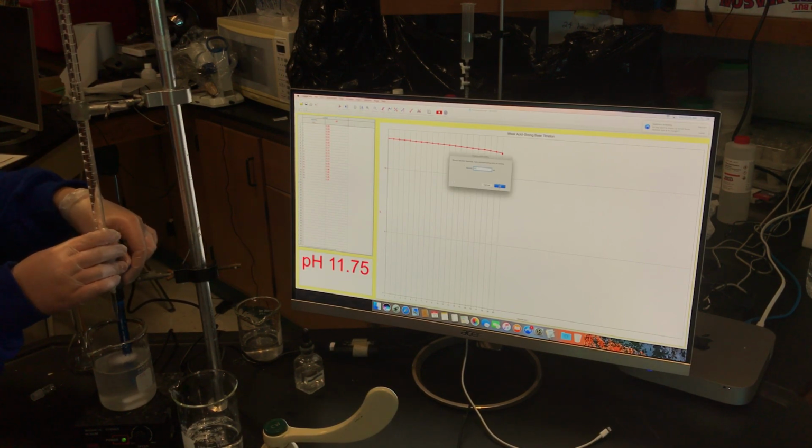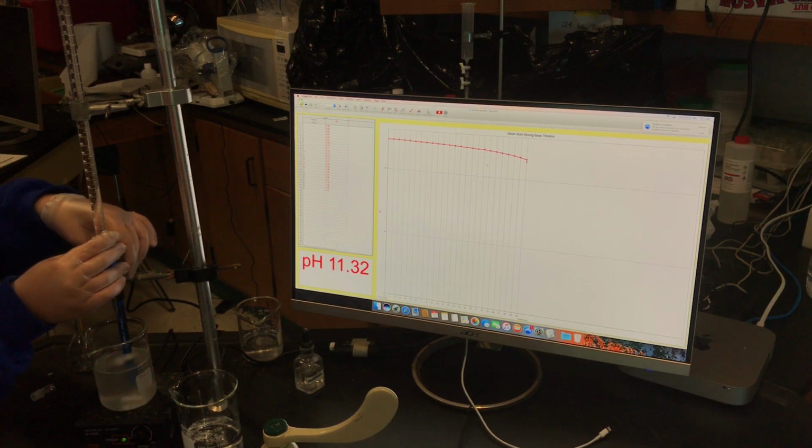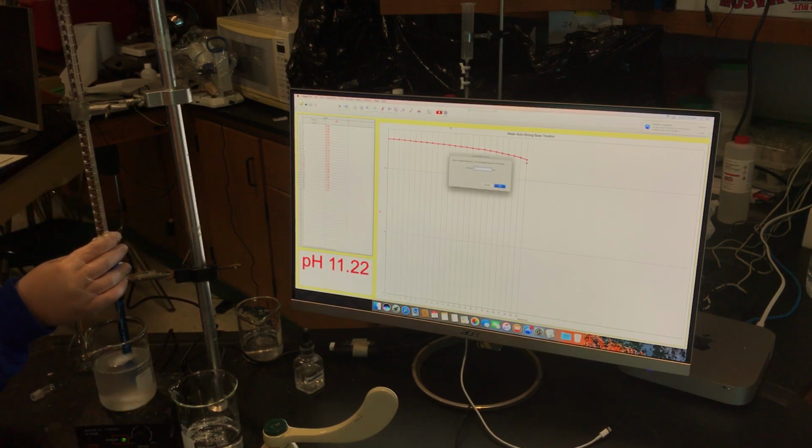Around 20. It's starting to show its exponential change, I think. The key here, if we get to 25 exactly, and it's on an asymptote, we know the tablet already is, oh, there it is, it's showing itself, it's jumping. Look at that, we're getting there.